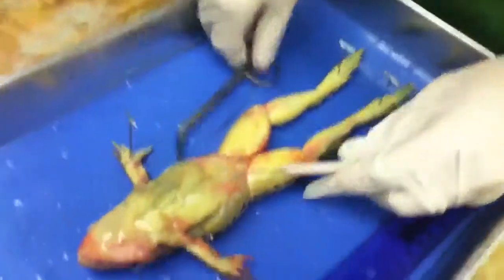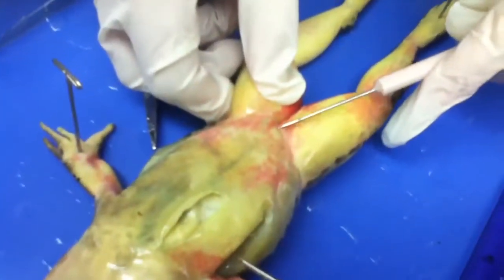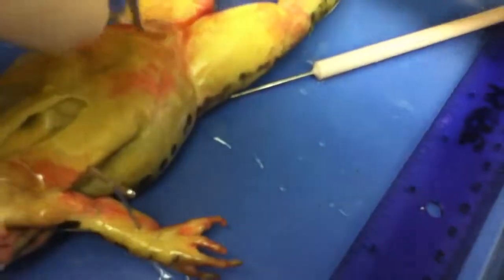May I make a suggestion? Use forceps to lift the skin and use scissors to cut along the center of the body from the cloaca to the lip. Turn back the skin, cut towards the side of each leg, and pin the skin flat. Oh, so we're supposed to cut it before we pin the skin flat. Cut.